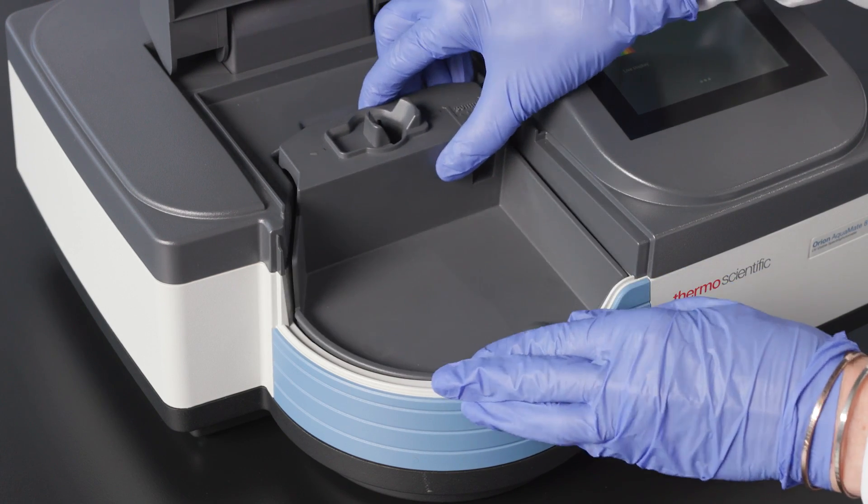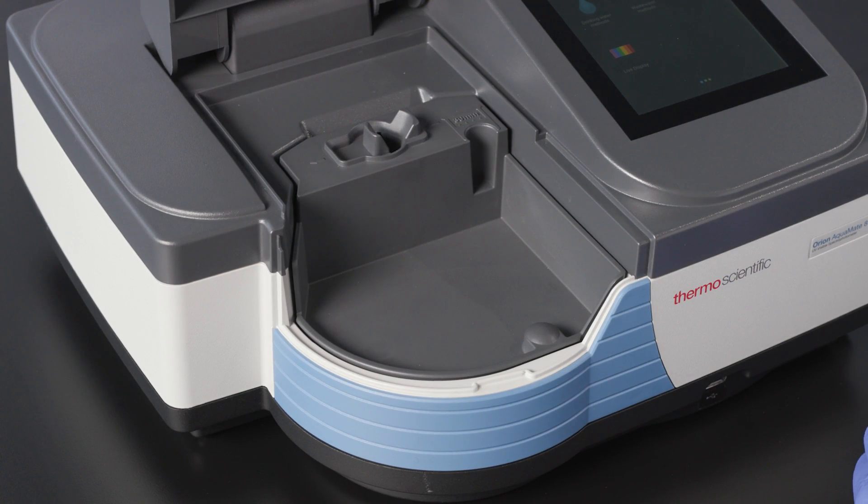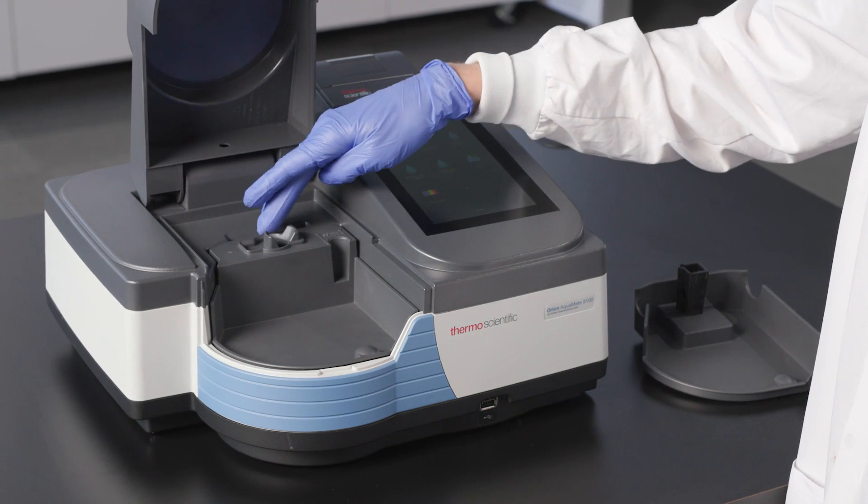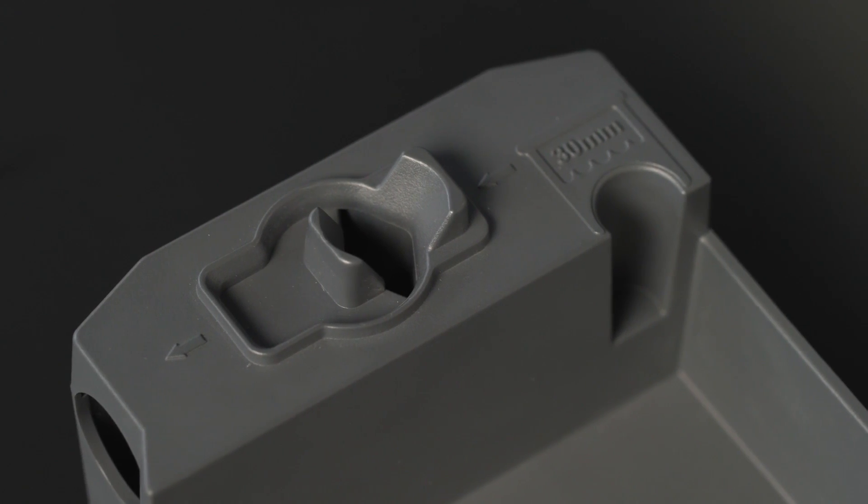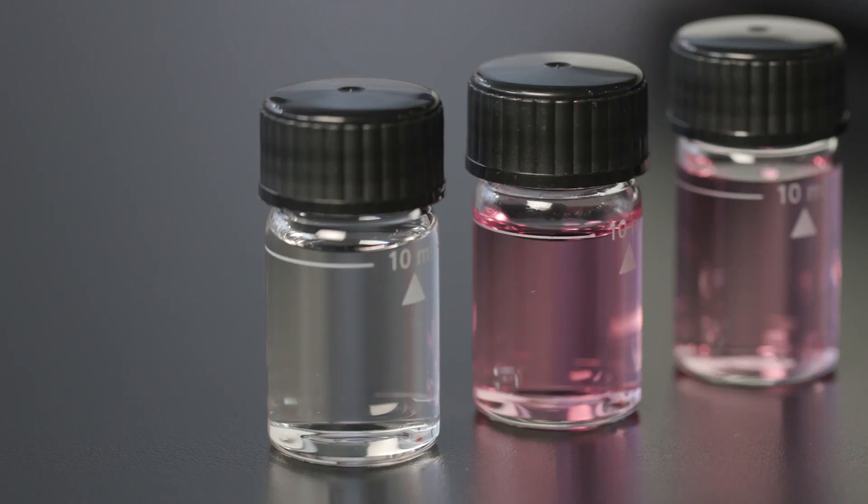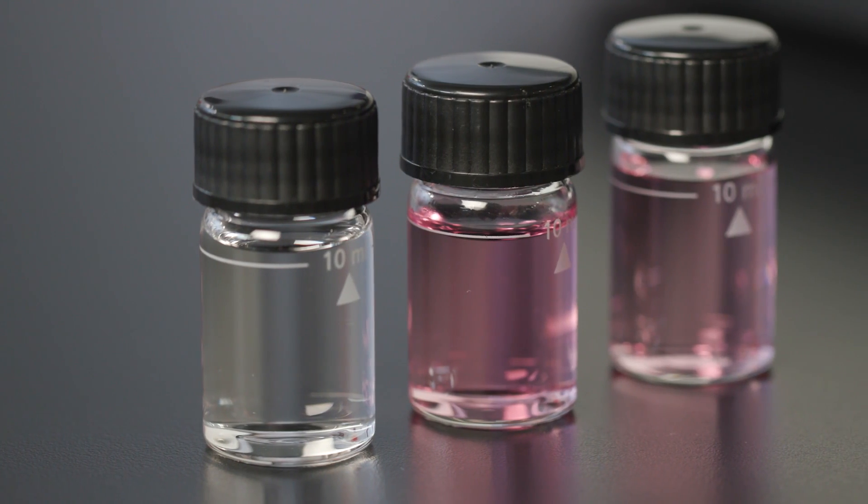The instrument is compatible with several different holders. The Aquamate comes with this round cuvette holder that works with cuvettes from 12 to 25 millimeters in diameter, the sizes that work with our Orion Aquafast reagents.